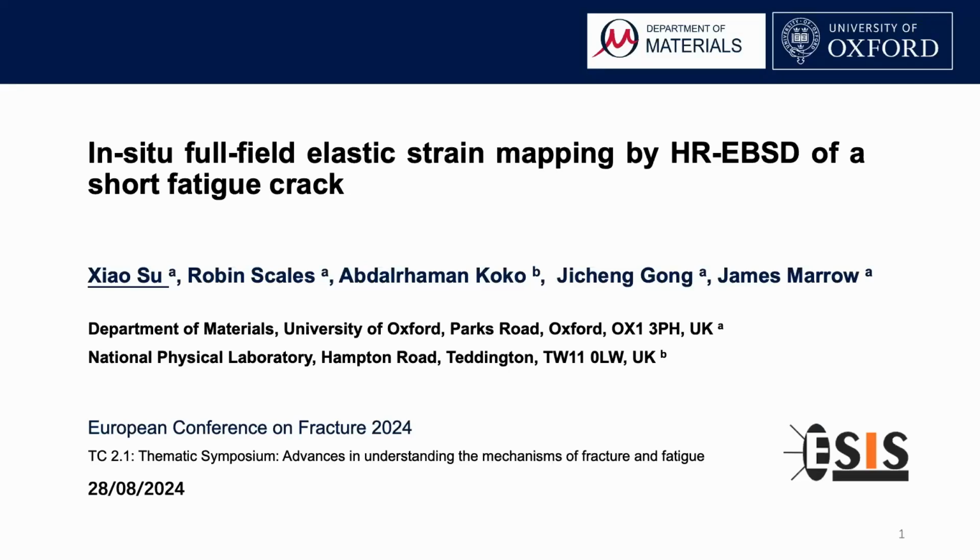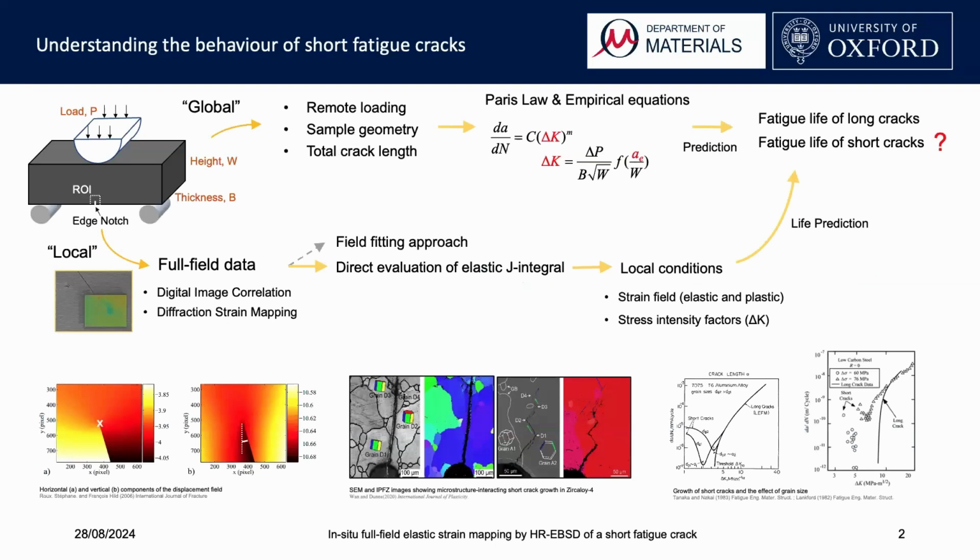I'm Xiao from the University of Oxford Department of Materials, and today I'll be discussing my research on a short fatigue crack in single crystal nickel. This presentation will show how the use of the high-resolution EBSD technique can help us quantify the crack driving force and improve our understanding of how these fatigue cracks grow, offering new methods and perspectives to study these crack behaviors in situ. To begin with, I'd like to give a brief overview of the research background.